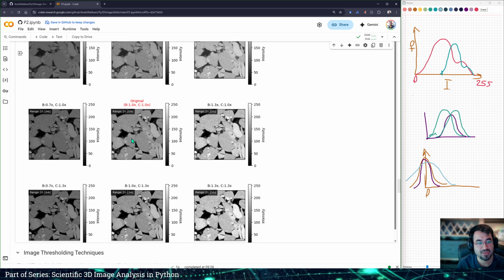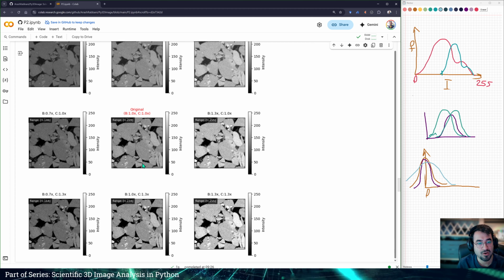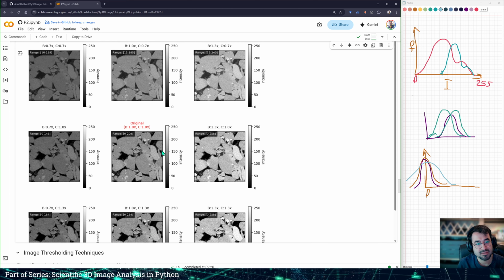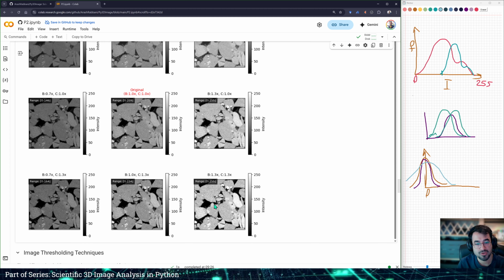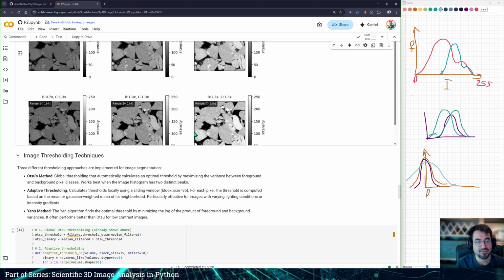So here at the center we have the original image, and as we move to the right, we are increasing the brightness, decreasing the brightness to the left, and by going down we are increasing the contrast. So you see possibly some of the images, this one or this one, these are actually more easy on the eye, I would say. You could see more information, and it is basically a better use of all the available image space that we have, right? Okay, perfect. So what's next?